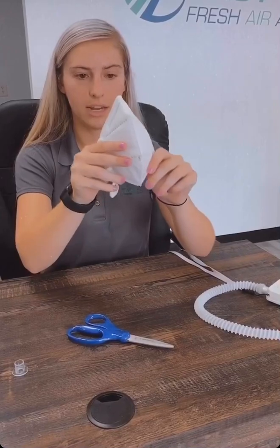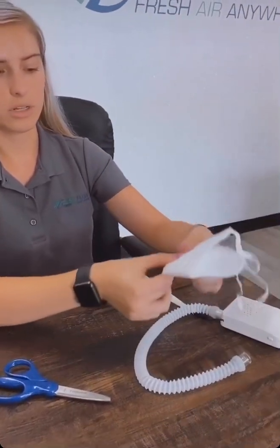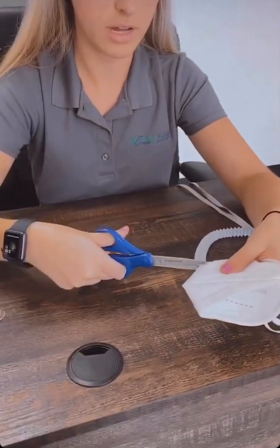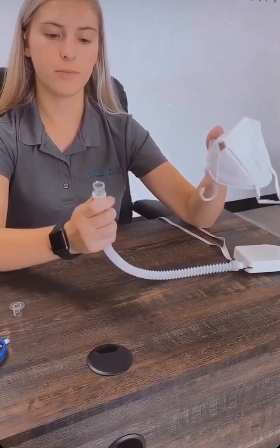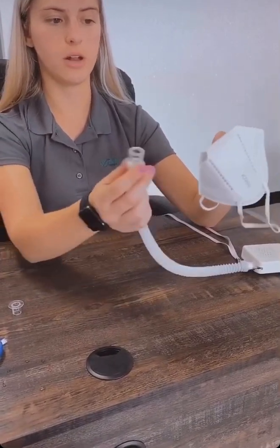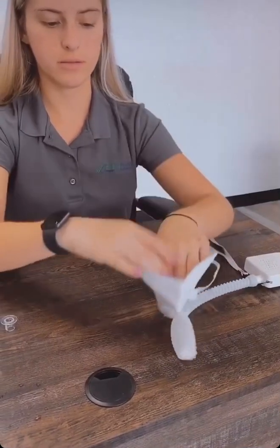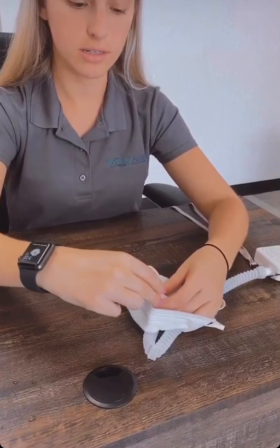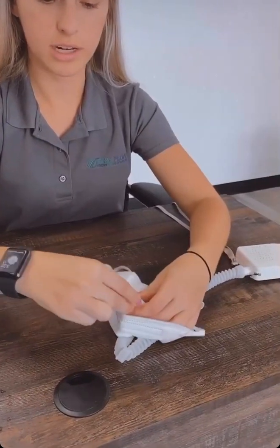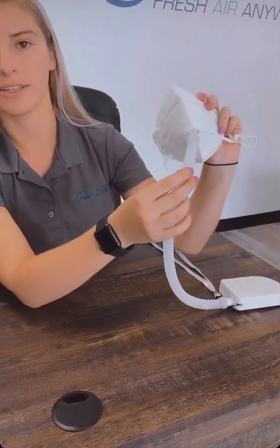So again, that is too small, even too small for me to wedge it in. So all I'm going to do, just make another cut. Alright, so now I have a hole that's big enough for my hose. It only took me 2 cuts, and all I do then is just wedge the hose in. Fits perfectly. Take the plastic connector piece, lock it in place, and now I have a tight seal on my mask.